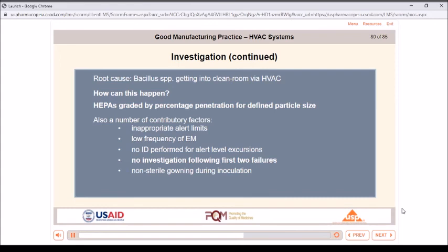The normal baseline values for the viable air and settle plate samples were between 0 and 10 CFU per sample. These values were being routinely exceeded over the period prior to the first batch failure until the facility was put on hold. There was a clear adverse trend that was not being identified until the investigation commenced. 4.